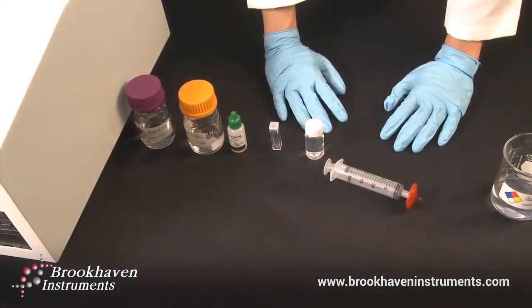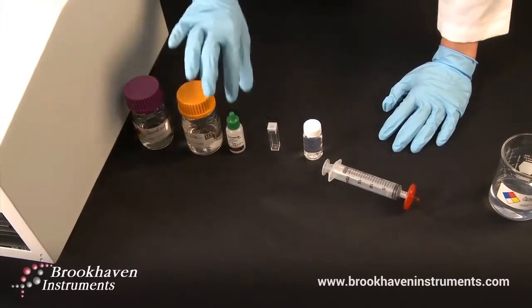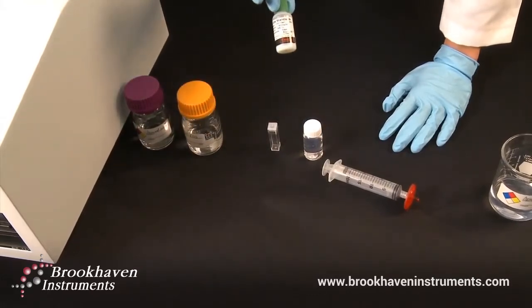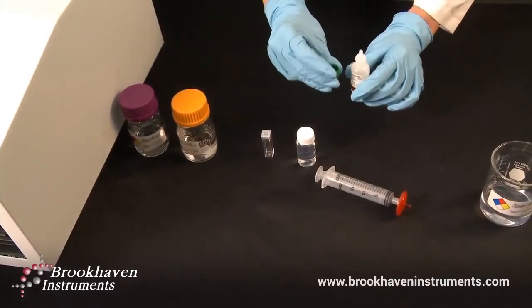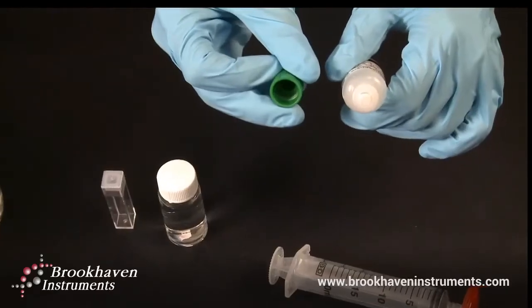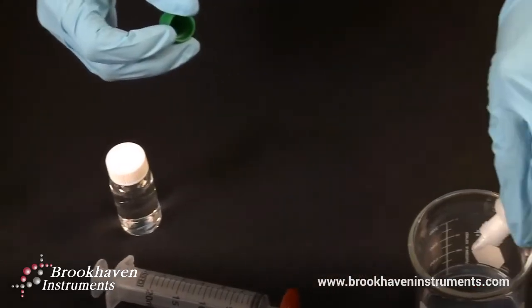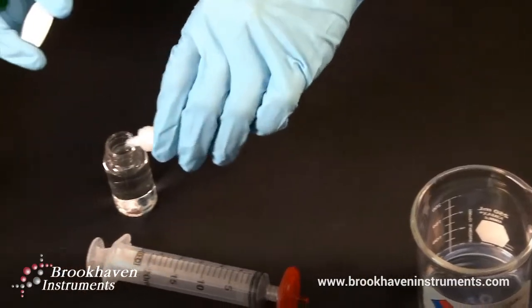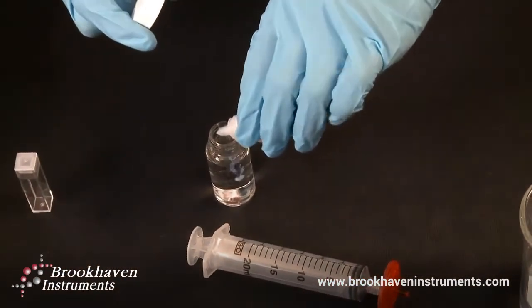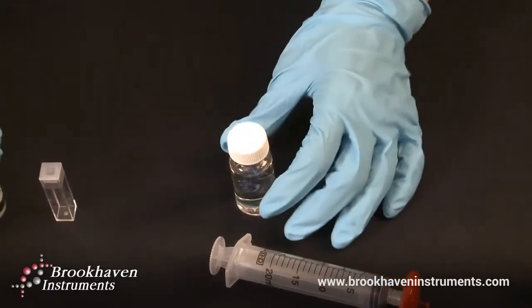Now to prepare our 92 nanometer polystyrene latex standard. Take your standard and first confirm that it is not expired. Inspect both inside the cap and top of bottle for any dried latex. If any is present, carefully clean with a lint-free wipe. Next, discard two drops of latex and place the third into the 20 milliliters of filtered 10 millimolar potassium nitrate prepared earlier. Make sure to cap the standard and latex suspension immediately.